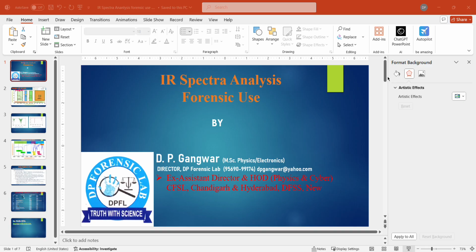Today in this video I will discuss IR spectra analysis for forensic use, because we know that for the identification of any compound or material, or the comparison of two samples, it is very essential to compare the peaks observed in the IR spectra. So whenever we are going to compare the peaks, we have to know the details of the peaks.